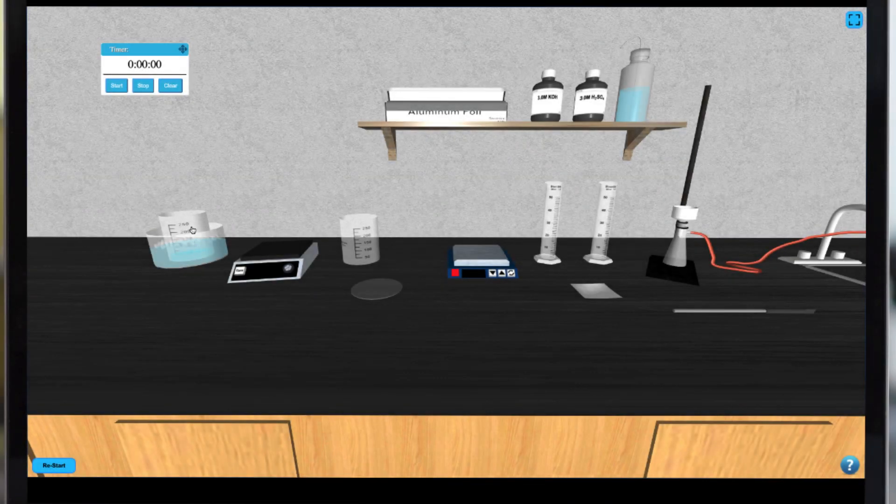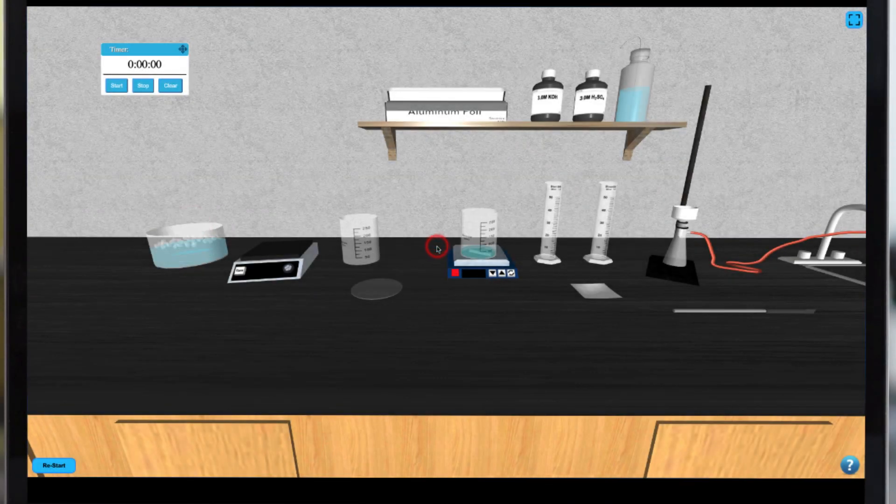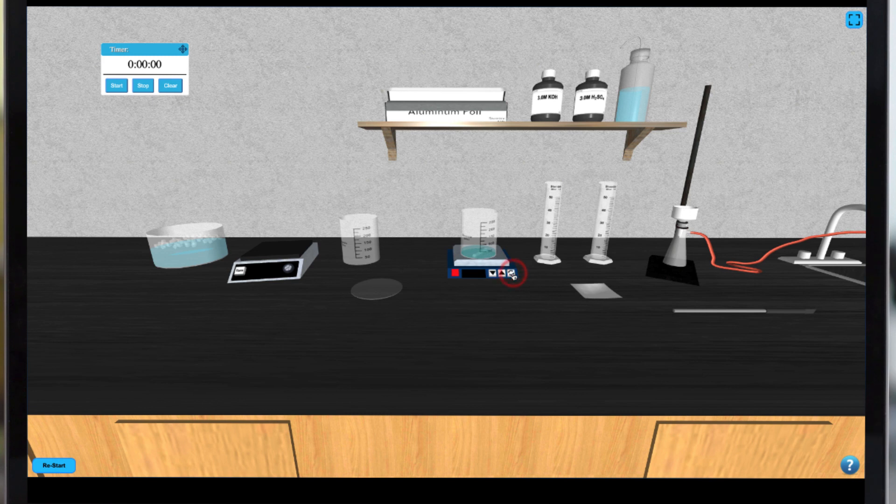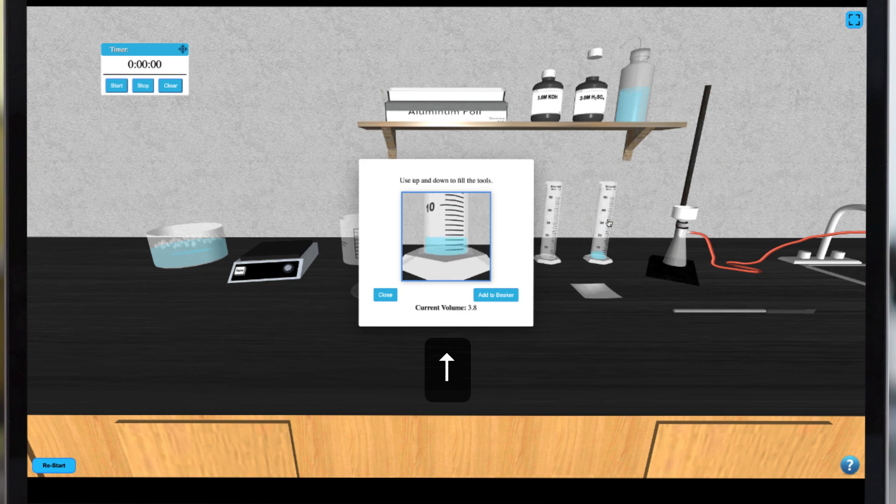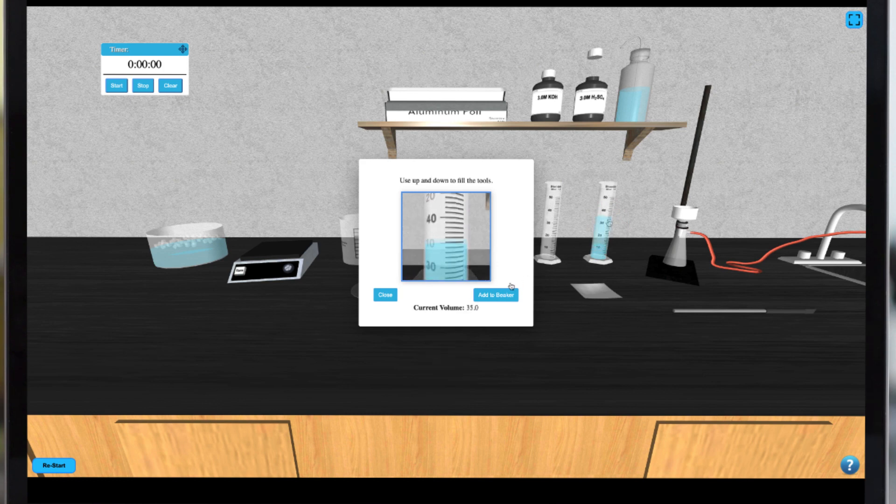When your sample is done cooling you can move it to the hotplate by clicking on it. You can turn on the stirring rod by clicking the appropriate button on the front of the hotplate. At this point you can obtain the appropriate amount of sulfuric acid by clicking on the bottle and then the graduated cylinder. Again you can use your arrow keys to select the appropriate volume.